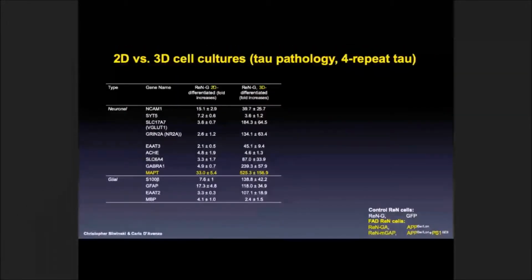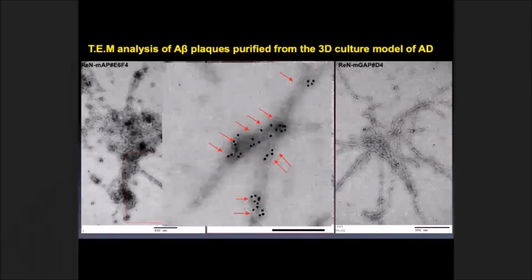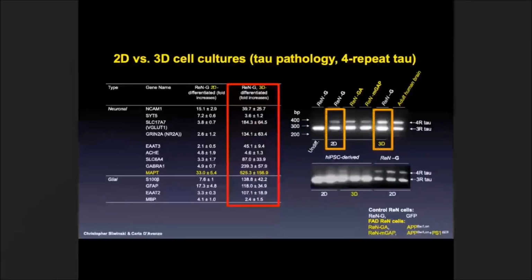And I can say that this is done within 6 weeks, and this is really accelerated in the single-clonal analysis to show much more robust results. Let's go to the neurofibrillary tangles. It's a little bit complicated, but because Dr. Chu is here, I want to show this data.